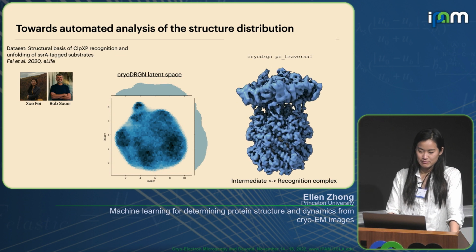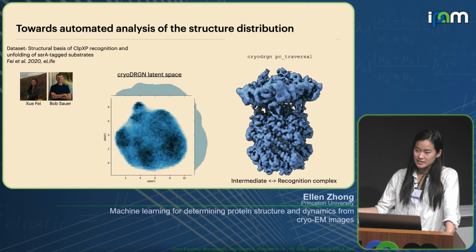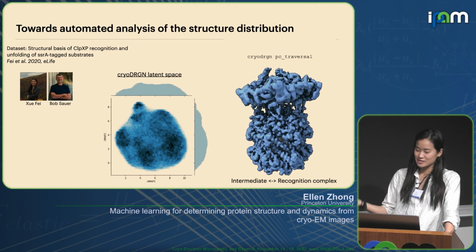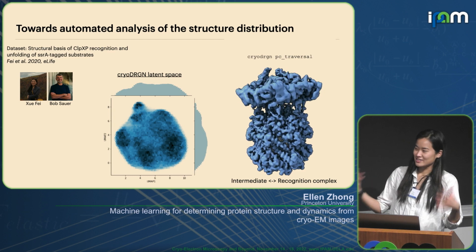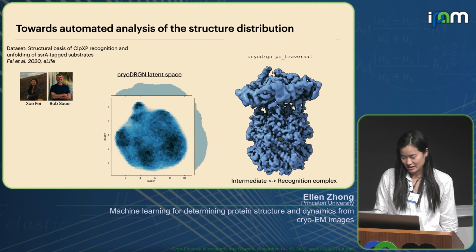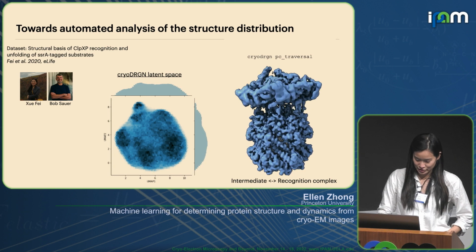Recently, we've made some work towards automating this kind of analysis, right? It's really good to interactively explore your data set and become very intimate with all the quirks of it, but what you really want is an automated approach, to be more reproducible and quantitative with what you're doing.